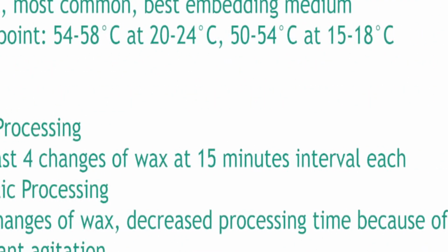So what's the main purpose of vacuum embedding? What's the setup inside a vacuum embedding chamber? What happens is that you introduce a sample into a zero atmospheric pressure, or negative atmospheric pressure. So you remove that one. Obviously, something penetrates faster, right? Because all the air was sucked out. Okay.